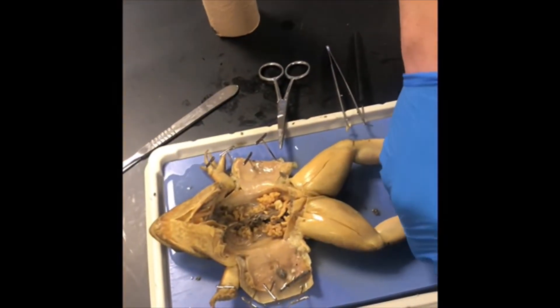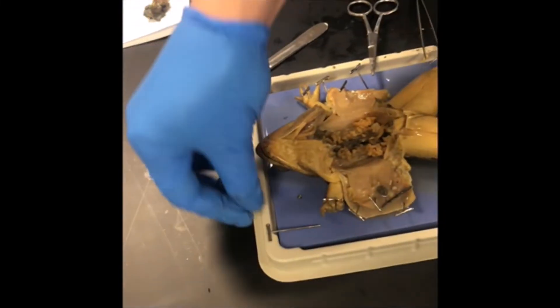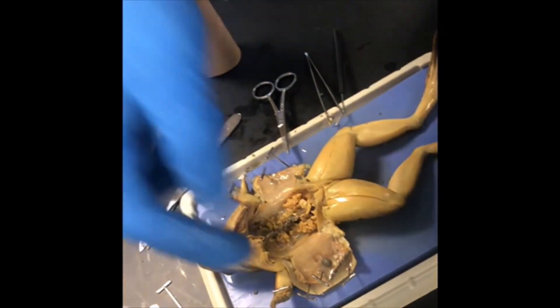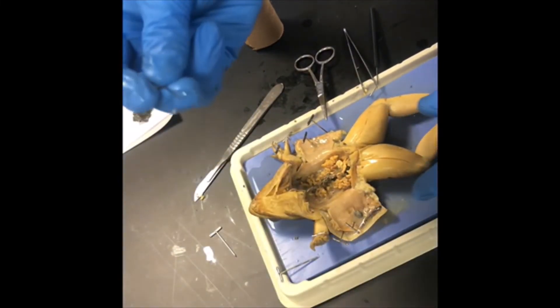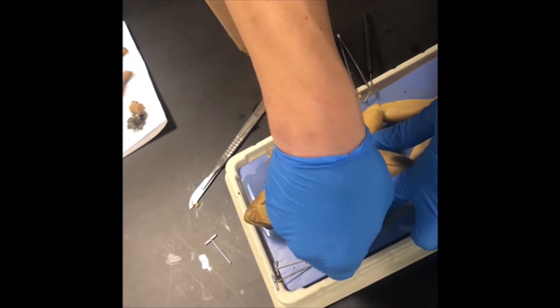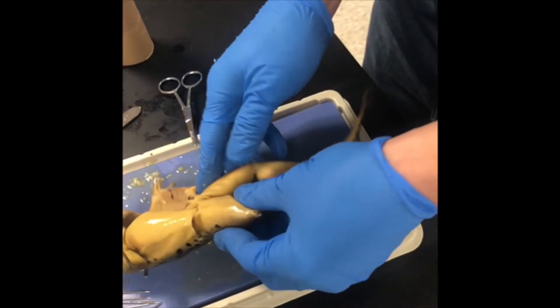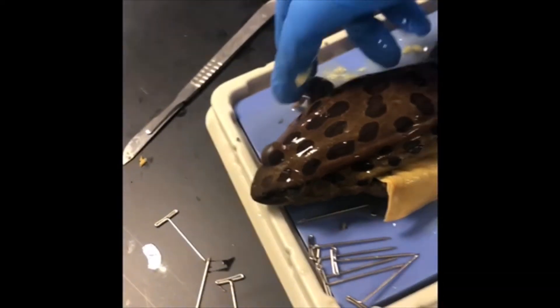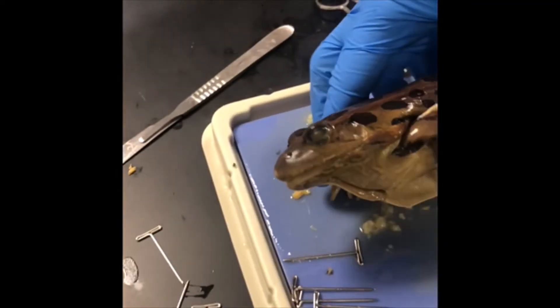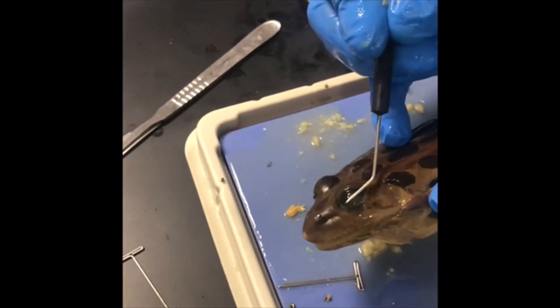We're going to flip the frog on its belly so we can look at the eyes. The pins are difficult to remove — if you take your index and middle fingers and wrap them around the top of the pin and slowly pull out, it works much better than going fast. You're going to identify the eyes, which have a non-movable upper and lower lid.